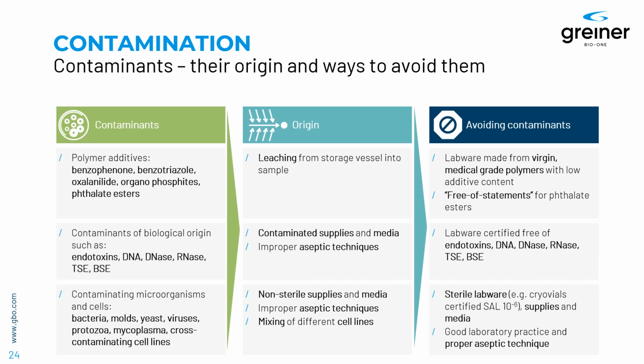Contaminants actually fall into different categories and they come from different origins. The first group is polymer additives. These polymer additives may leach from plastic labware into your sample. They may leach from the storage vessel into your sample and thus contaminate your sample.